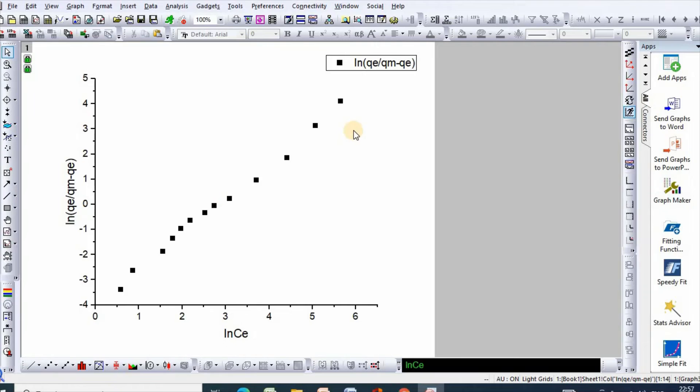So, here is your plot. Then, go to analysis.